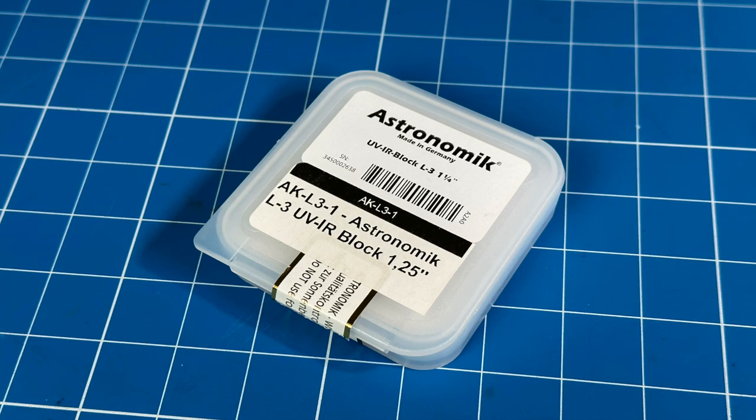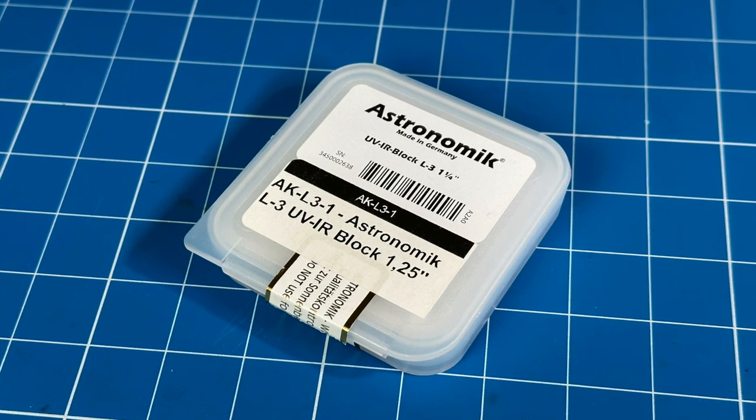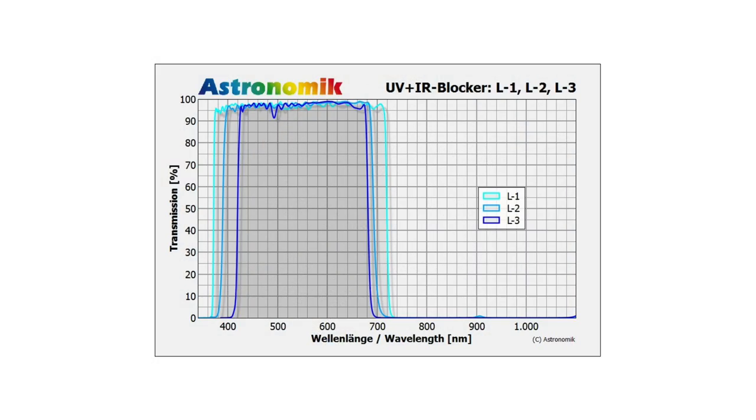Let's take a look at one of my own filters, an Astronomic L3, which is a luminance filter. I purchased this specific UV-IR blocking filter because it is designed for refractors that have a less than perfect color correction, which is the case of my own budget refractor. This filter rejects everything under 420 nm, which is the deep blue part of the spectrum, where most refractors start to degrade pretty significantly. To understand why that is important, I prepared this slide.